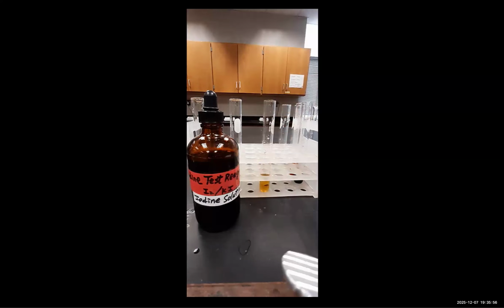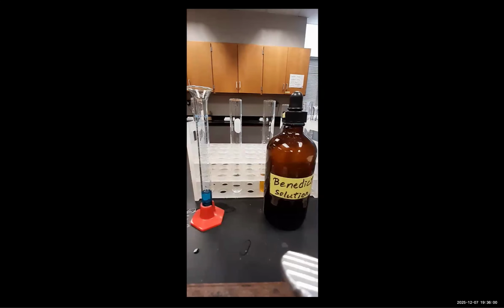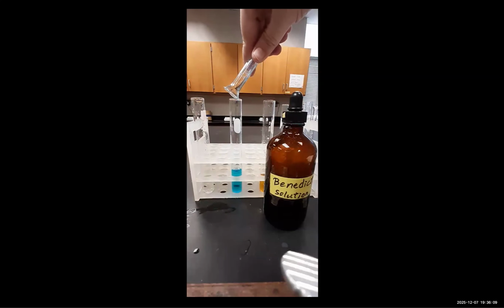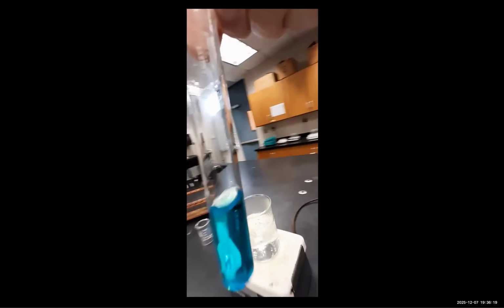Now let's take a look at the last test. We're testing for glucose using Benedict's solution. So we add the Benedict's reagent solution. And remember, we've got to heat it. If it's a positive test result, we'll see this brick red, brick orange color, but I don't think we're going to see much of anything because this beaker water is just deionized water.